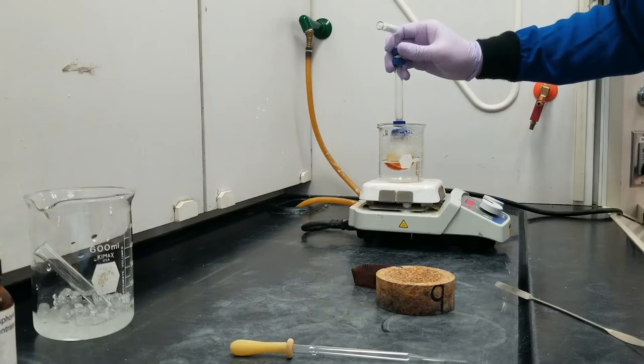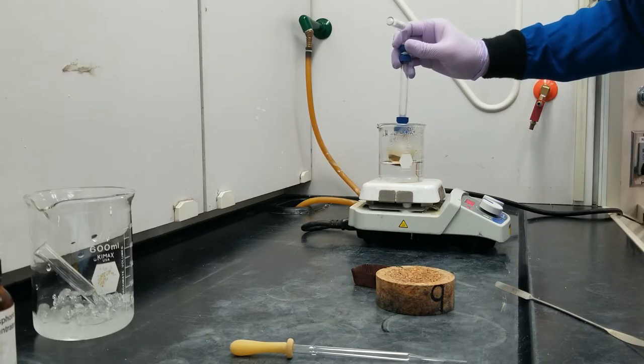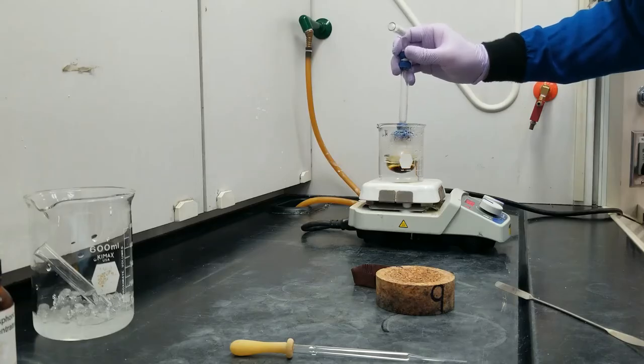Now, what I'm expecting to happen as I swirl this in my hot water bath is I'm expecting this to darken. The ferrocene, when it's diluted in solution, is yellow in color, whereas the acetyl ferrocene is a darker orange. We're going to see this a bit later as we're separating by column chromatography. But for right now, I hope you can see the darkening of the reaction is a positive sign that this is working as intended.